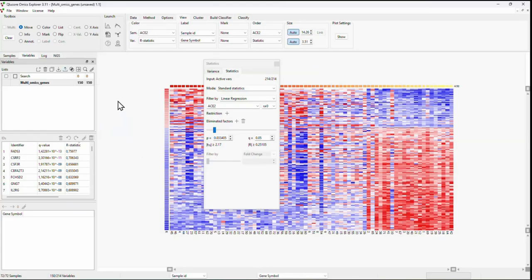This is how you can do it for one of the proteins here, but we can also take advantage of using the Biomarker Workbench for this, which can work with multiple proteins and correlation to the genes. So let's go back to the presentation and have a look at that also.